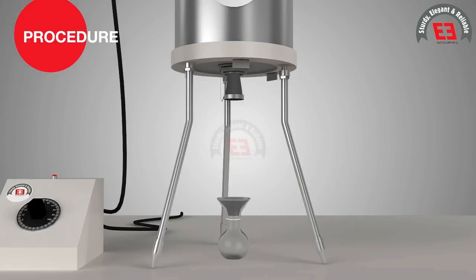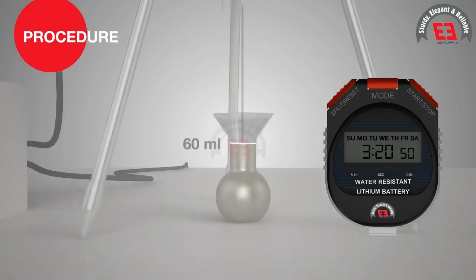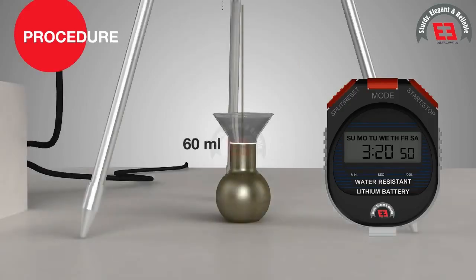The cork is removed and the sample is allowed to flow through the orifice, which is collected in the receiver, and simultaneously stopwatch is started. The timer is stopped when bottom of meniscus of the sample reaches the 60 ml mark, and the time in stopwatch is noted correct to 0.1 second.